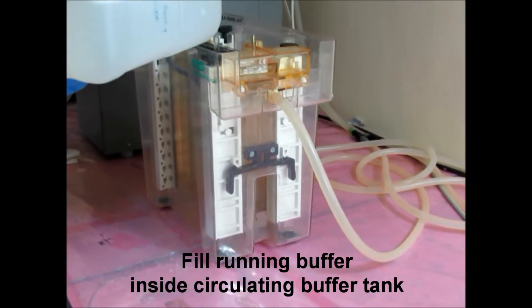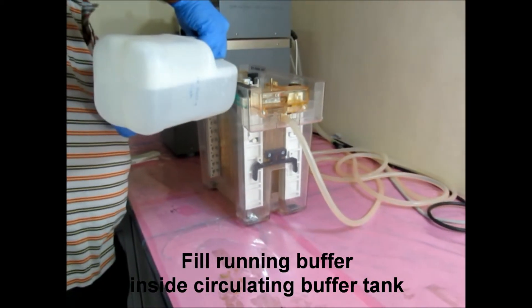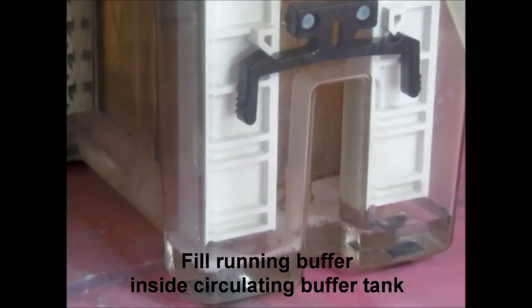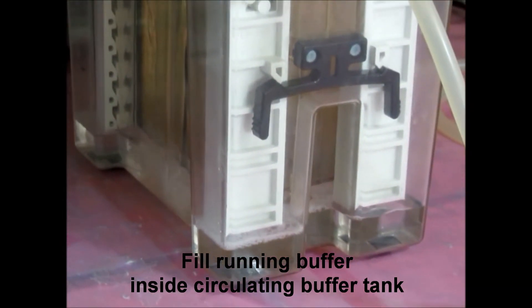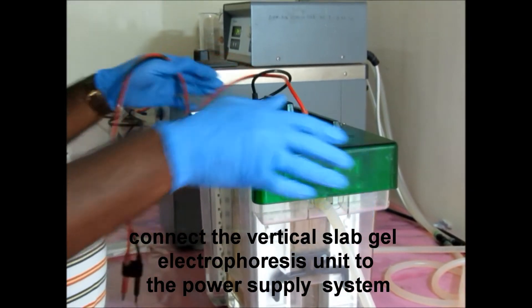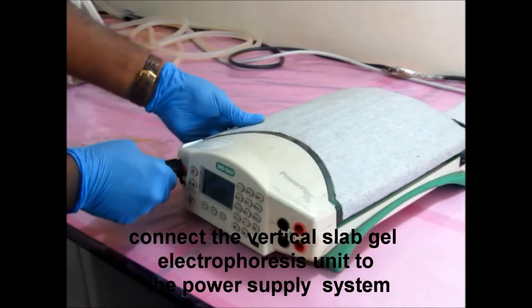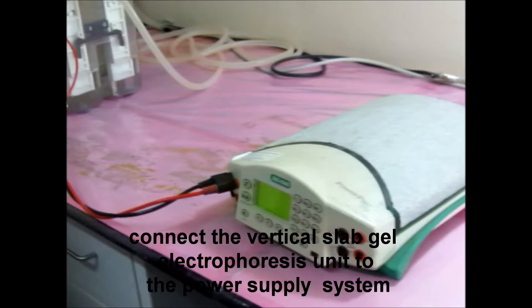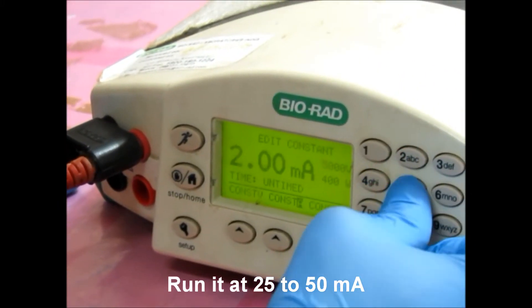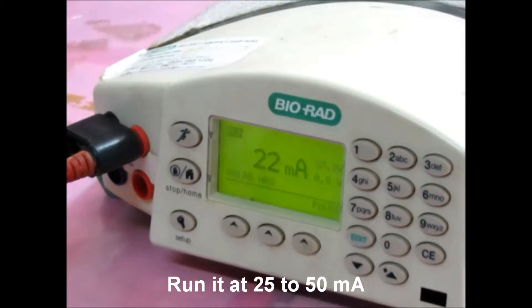After pouring the agarose sealing solution, place the gel cassette inside the circulating buffer tank. Fill running buffer inside the circulating buffer tank. Connect the vertical slab gel electrophoresis unit to the power supply system. After connecting, run it at 25 to 50 mA.